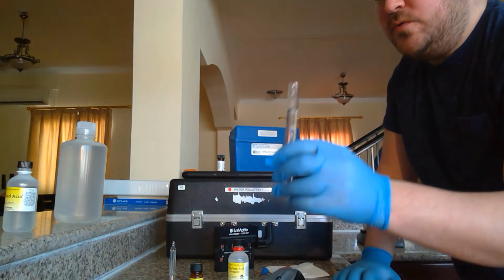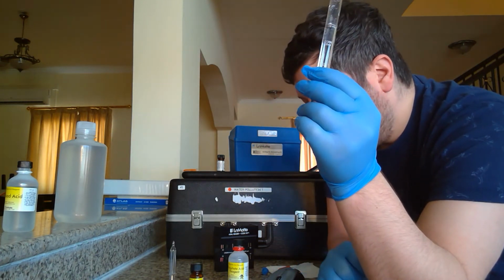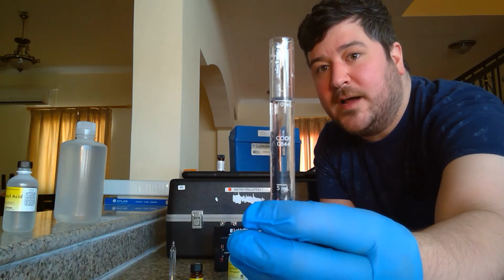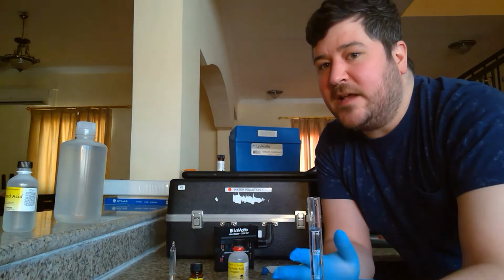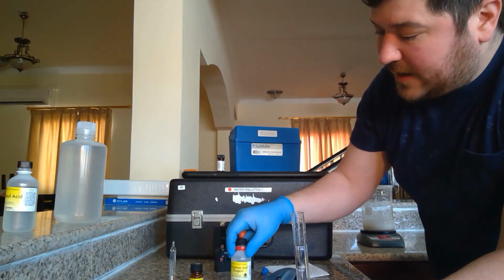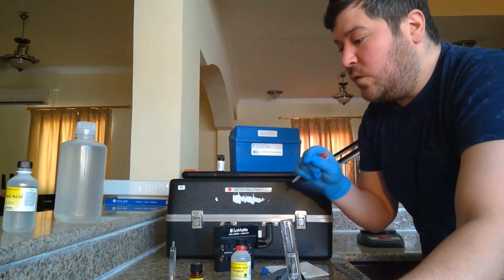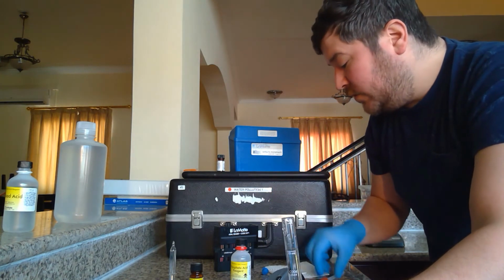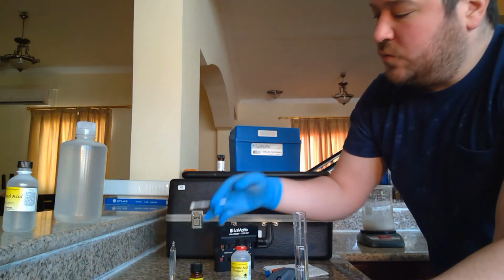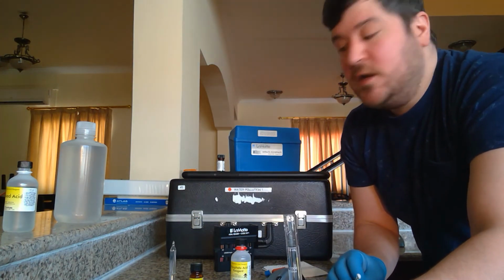Well, it's time to do the phosphate test. This is very similar to the nitrate test, just a few different reagents and measurements. So the first step is add your sample water to the 10 milliliter mark. The next step is then use the 1 milliliter pipette here to add the acid reagent, cap, and mix it. We don't have to wait any time. So once I've done that and mixed it, I will use a new clean and dry spoon. This is another spoon in the kit to put the phosphate reagent in. And that's it. I think it says to wait 5 minutes. So here we go.